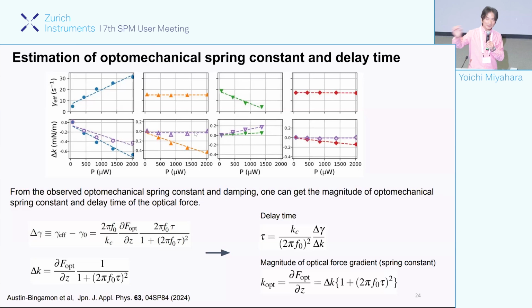Once we correct for the temperature-induced frequency shift, it is almost non-existent at the other positions, and at position 3 you get a larger, positive frequency shift. The gross frequency shift almost looked zero, but the actual corrected one showed an increase in the resonance frequency.